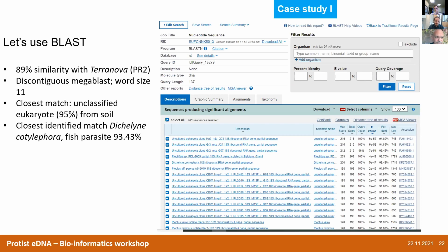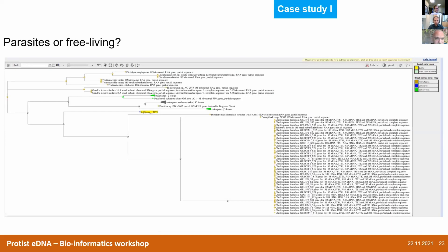We do exactly as before. Because 89% similarity is quite far related, we try with discontinuous megaBLAST with a word size of 11. We get uncultured eukaryotes, which doesn't help because uncultured eukaryotes can be anything. But the closest identified match is Dichelyne cotylophora at 93% — a fish parasite. If I go to the distance tree of results, I can see where our ASV is supposed to branch.